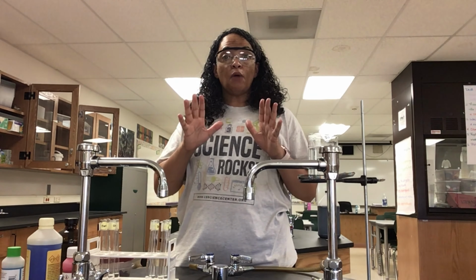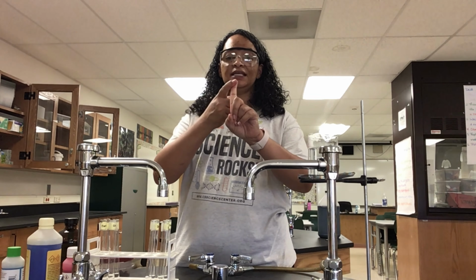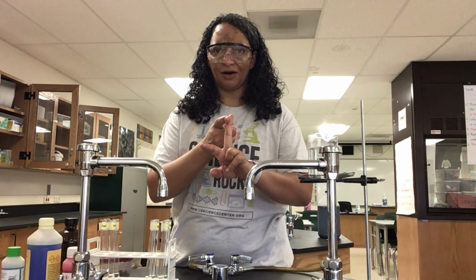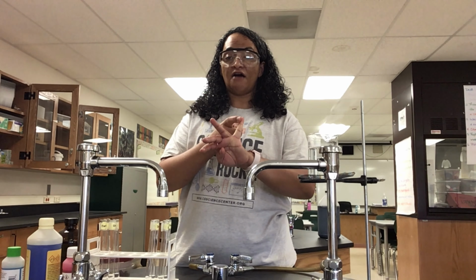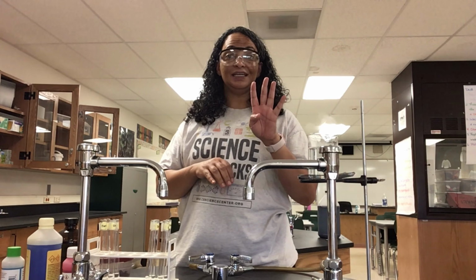So what we're looking for today are 4 different macromolecules. We'll be looking to see if seeds have lipids, which is a type of fat, to see if they have complex carbohydrates, so really big carbohydrates, to see if they have simple carbohydrates or simple sugars, and to see if they have proteins.